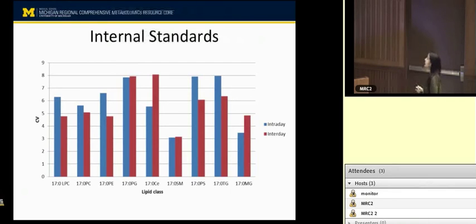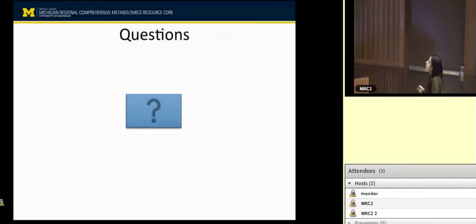And this heat map, again, for significant lipids shows the similar thing. These green ones are all the LRT controlled samples, and the blue ones are LRT trained samples. So now in this cluster, you can see that they cluster pretty well with the high response to training rats after the training. And these low response to training controls separate from the rest of them. And again, two big clusters here that look a little different.